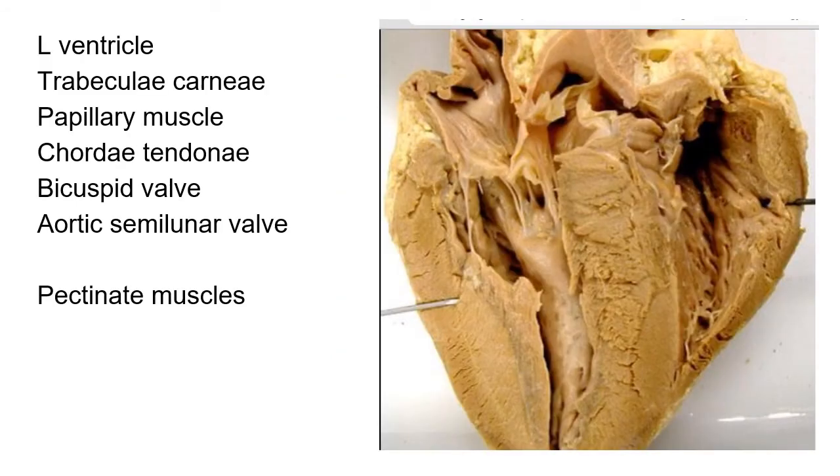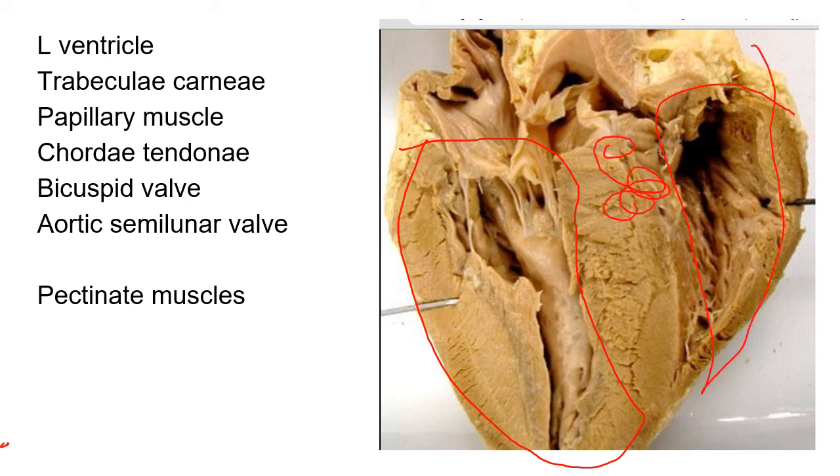So now we can see both ventricles. I'm going to outline them for you. Okay. There is a ventricle here, and then there's a chamber of ventricle over here, and we see this thick wall between the two. And if you look carefully, you'll even see atria above them.